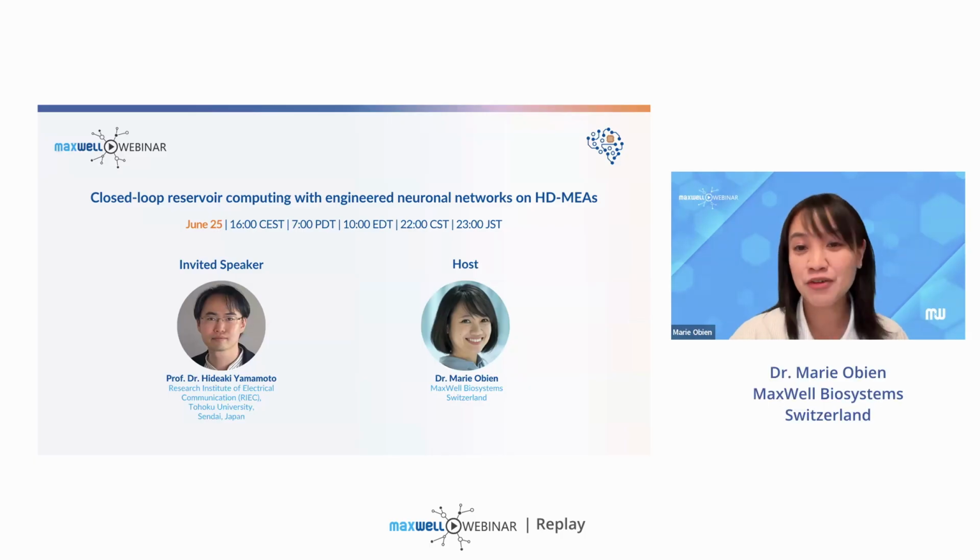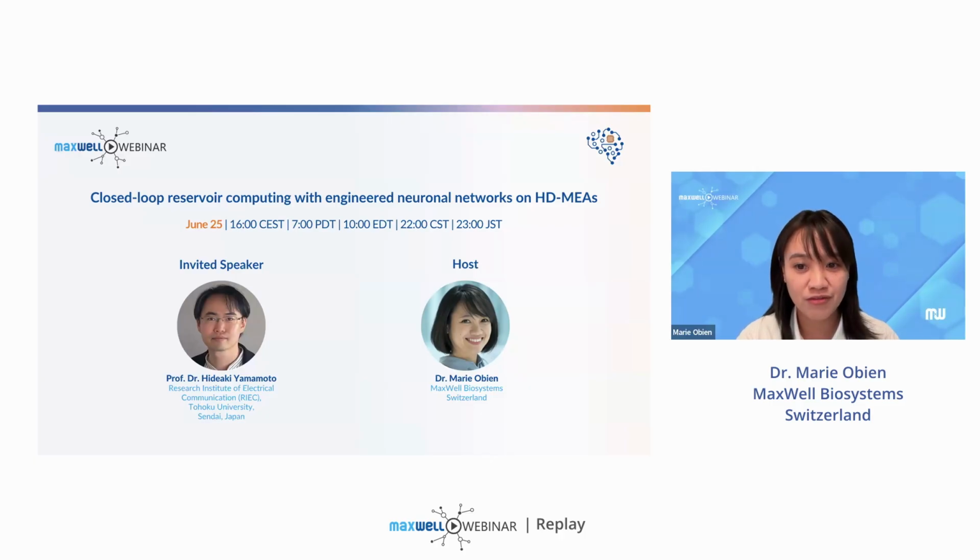Thank you so much. And if you would like to learn more about how to adhere cells on our HD-MEAs, we do have cell culture protocols available online. And I think we also have some application notes that show over 3 months or even 6 months of cultures still well attached. So thank you for the question. All right, next we have Stephen.